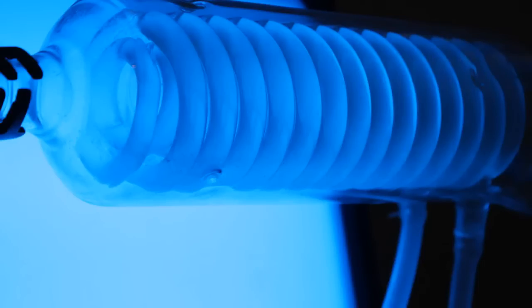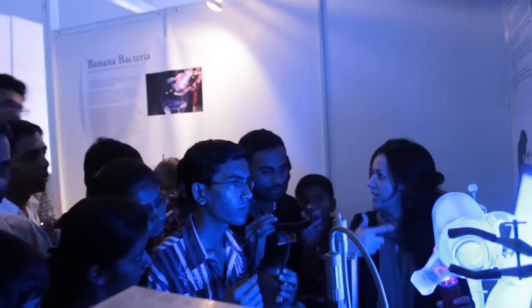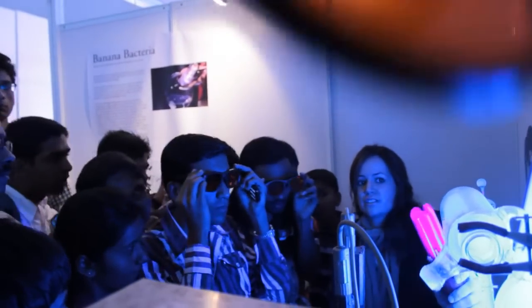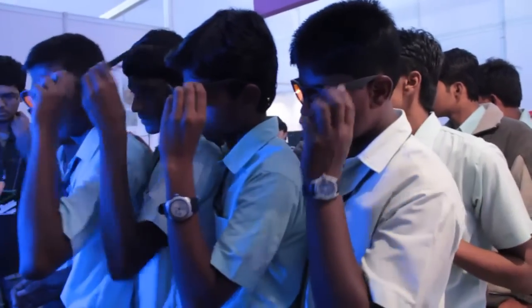A condenser placed outside the device acts as a window by having cells pumped from the inside of the reactor vessel. The installation creates a stress-sensing device both functionally and as an experimental aesthetic of scientific parts. The device probes into invisible processes on a genetic level and brings these into view by allowing stress to be read as light.